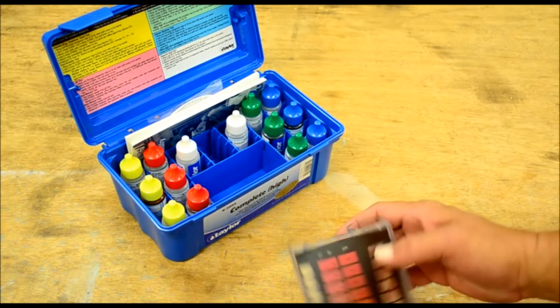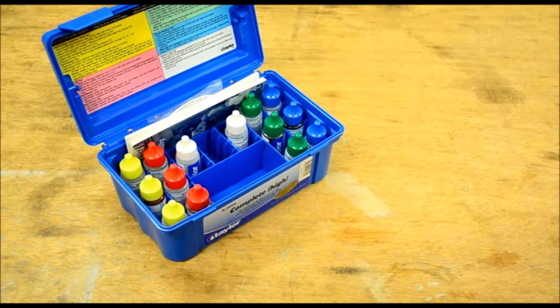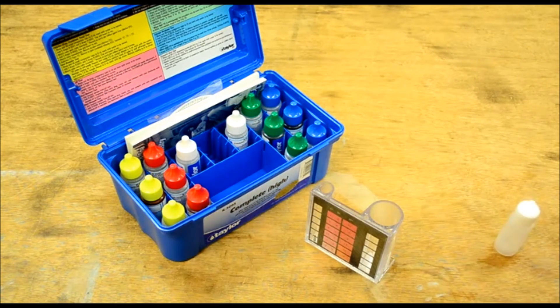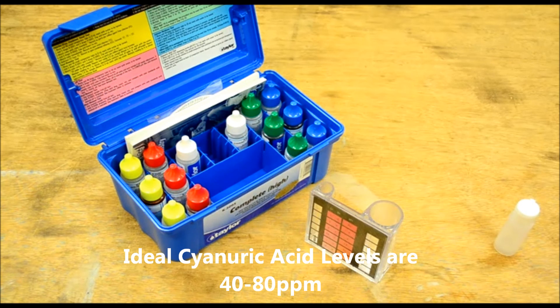Our cyanuric acid reading was so low it wasn't giving us a proper reading with the chemical tester. I think it's telling me somewhere around 30 or 40. I have a digital tester that will give a more accurate reading on that, so I'll bring that down here and show you how it works to get a proper cyanuric acid reading.